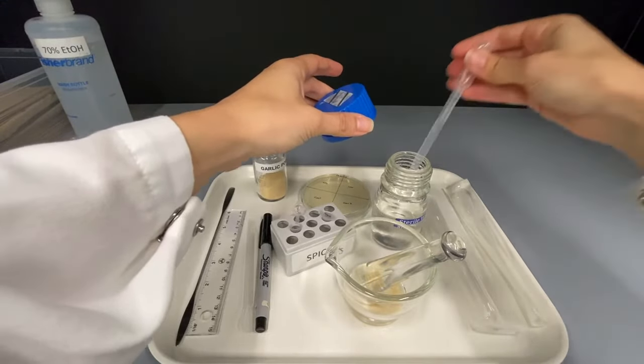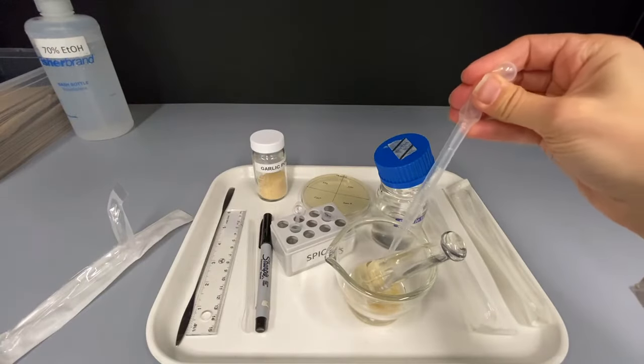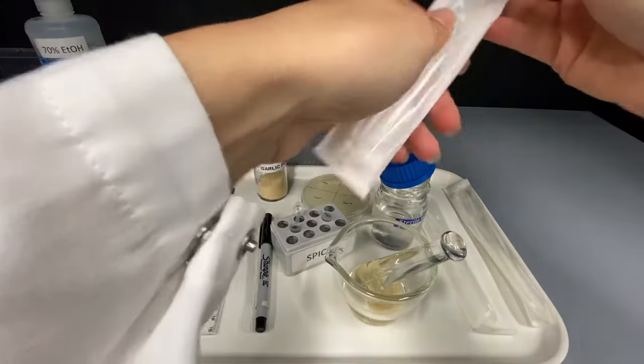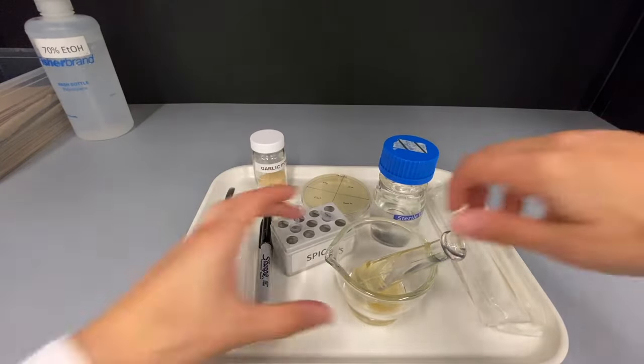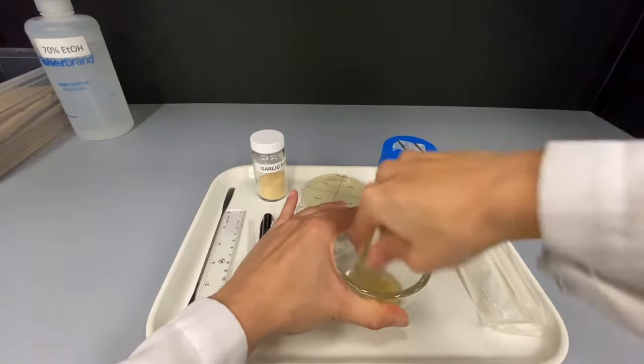Add 2 milliliters of sterilized water using a sterile plastic pipette. Grind for 10 to 20 seconds.